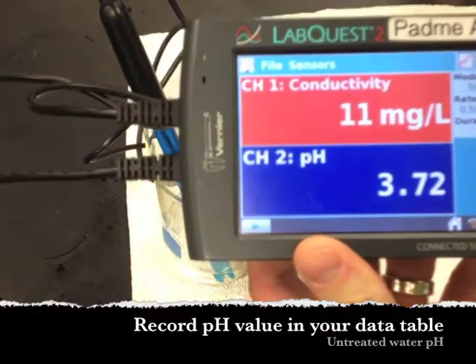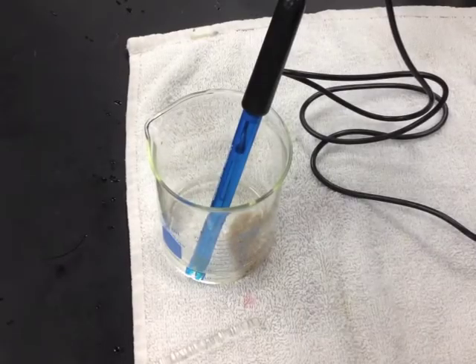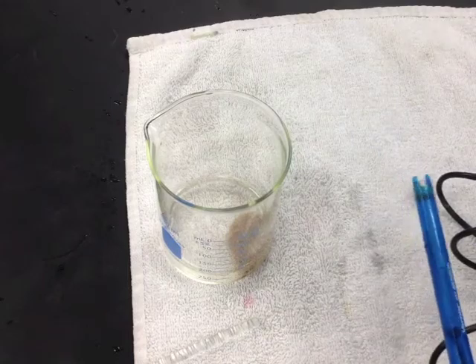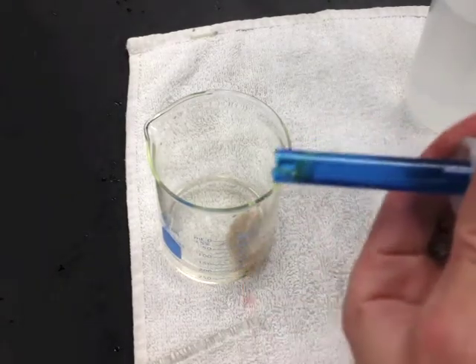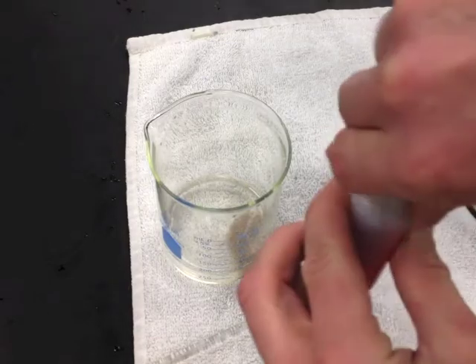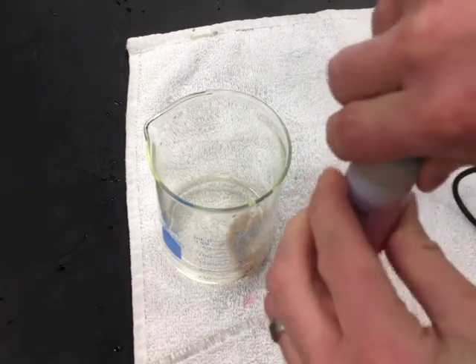When you're done using the pH meter, just like the conductivity probe, make sure to rinse it off carefully. Return the pH meter back to its container when it's not in use. Never ever let the pH meter sit out — it'll dry and it won't work; it'll break.